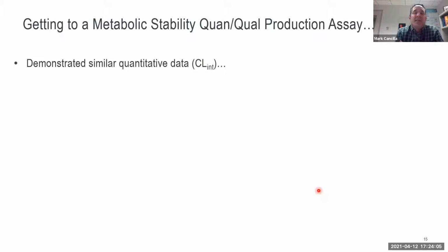All right, so let's discuss how you try to implement a new assay at a very large company. And I'm sure many of you had to deal with this also. You can talk the talk and show the papers, but everyone wants to see the data. And everyone was very clear to us that how important the intrinsic clearance data was, so don't mess it up. They didn't care if we added metabolism data to our data packages, but we had to really make sure we didn't mess up the intrinsic clearance calculations.